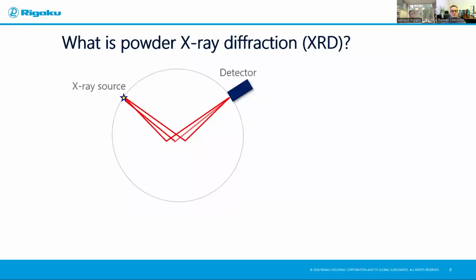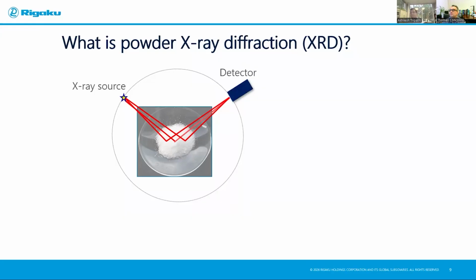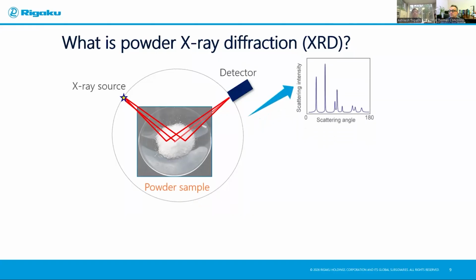So essentially, whichever XRD instrument you use, you have an X-ray source and a detector, like is shown here in this cartoon. You'll bring your powder sample, and in some cases, bulk samples. And then 3 situations arise out of the diffraction. Situation 1, you will get a crystalline powder diffraction, such as the one shown here.